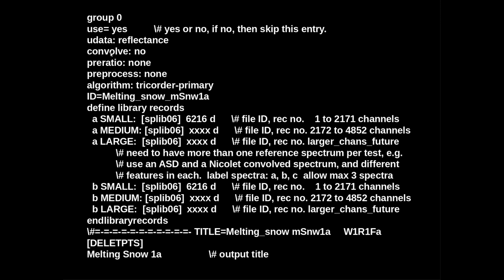We early on had an idea to convolve the spectra on the fly, but we've abandoned that. We can turn it back on, but we felt it's better to convolve the spectral libraries so that you have the references available at the resolution of your spectrometer. So when you want to do comparisons, you've got them. Because if we didn't do that, you'd end up having to do it anyway when you make figures for the journal, for scientific papers.